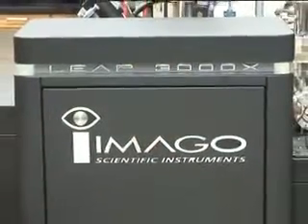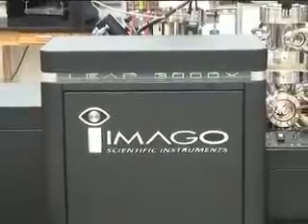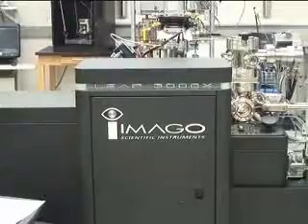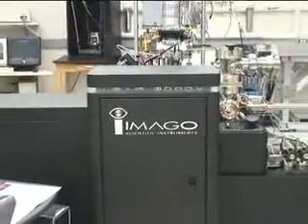The purpose is to bring together some of the leading groups in material science who work on atom probe or are interested in atom probe tomography, and to also show them our capabilities and to establish our reputation in this field. One of those capabilities is the star of the new Keck Lab, a $1.6 million local electrode atom probe, or LEAP, microscope, one of only 4 such instruments in U.S.